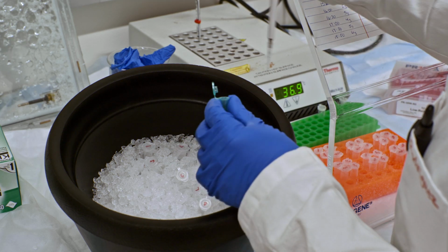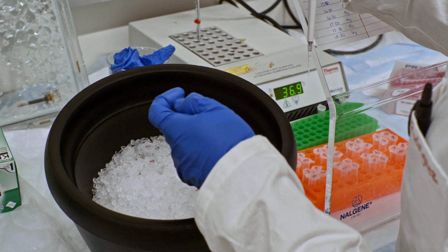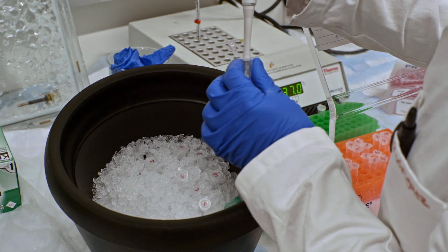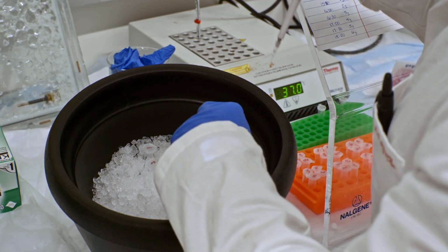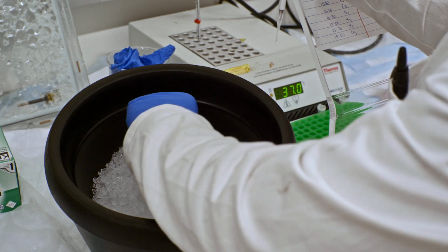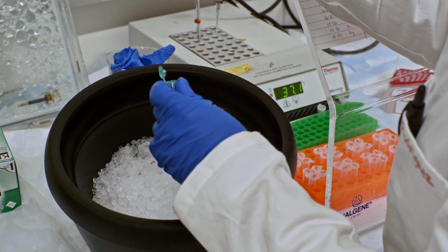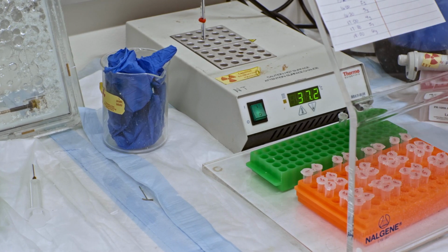So first, going to get an aliquot of your enzyme, typically 1 microliter, which is about a picomole of enzyme for this particular assay, and mix it well. And then keep doing that for every reaction vessel. Of course, replace the tip. So after adding polymerase to all of these different samples, I now put them behind the blocking screen.